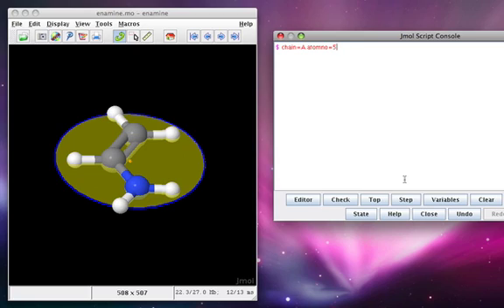This can be useful in drawing curved arrows, for instance, because you can specify the center of a large group of atoms, and this will end up being an empty point in space to which you can have the curve of the arrow pass through without any awkwardness.